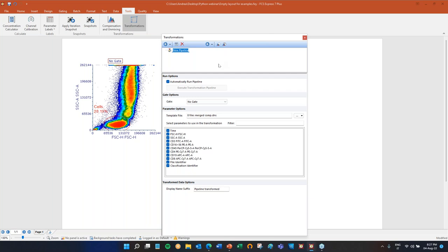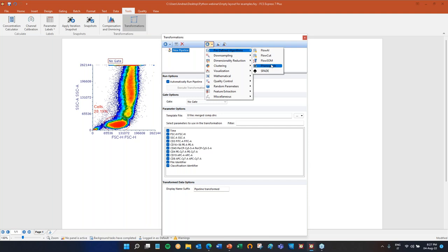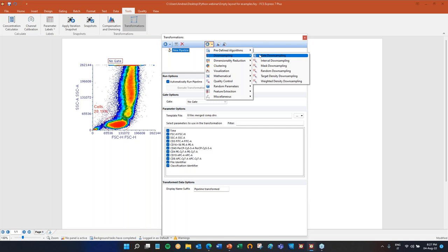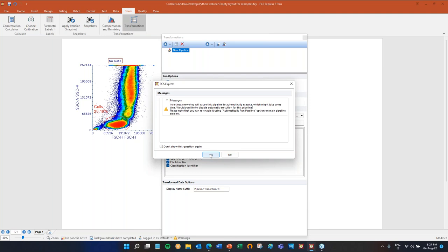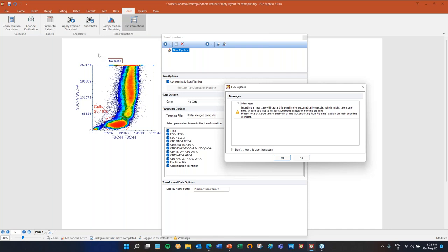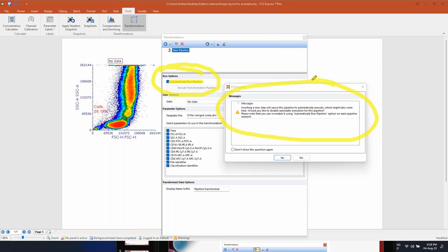Click on Pipeline and you have created a new pipeline — this is the main pipeline body. You can call it whatever you want. Here you can select an input gate and parameters. You can start with all cells and all parameters. What you're deciding here is which events and which parameters you want to be accessible within the pipeline — not necessarily which ones your algorithms will run on, but which ones you want to be able to access.